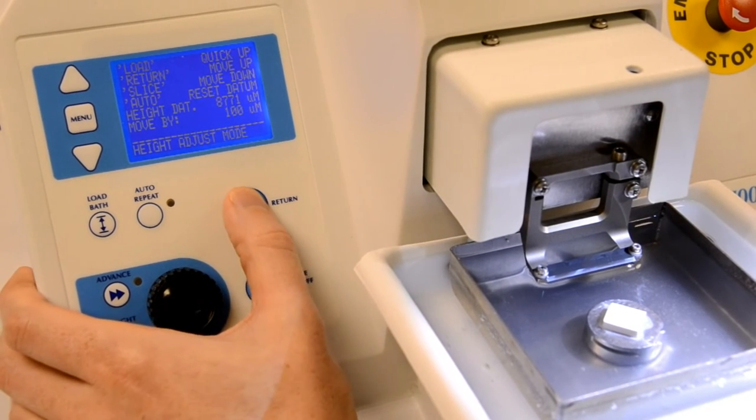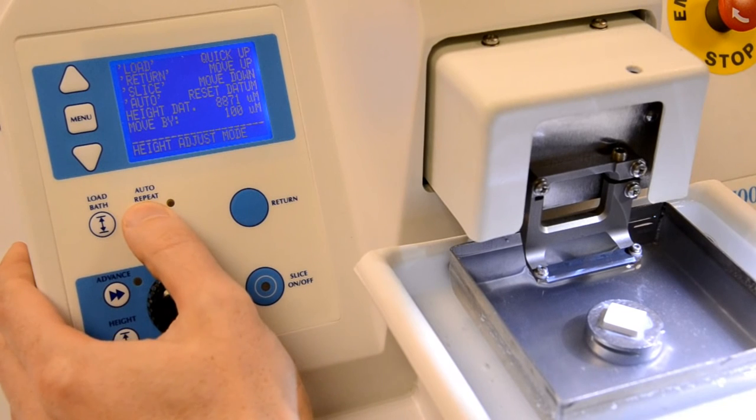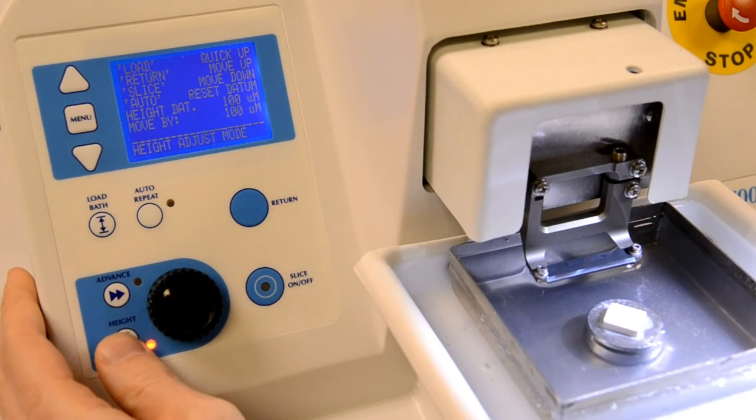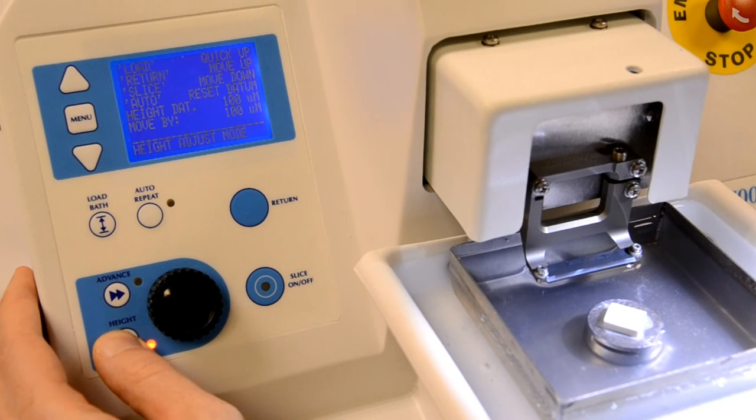Once you have brought the specimen to a suitable height, press the auto-repeat key to reset the height datum to zero and use the rotary knob once again to set the desired slice thickness. Press the height key to exit the height adjustment mode.